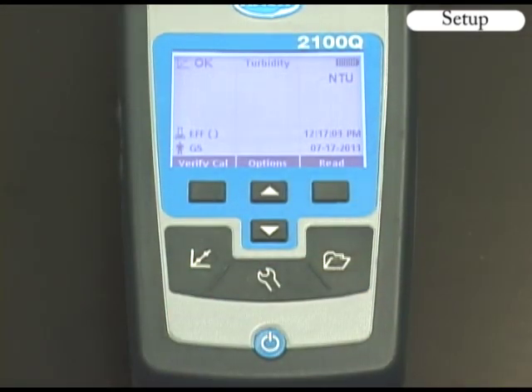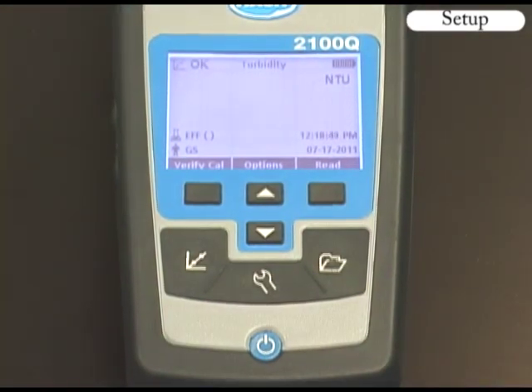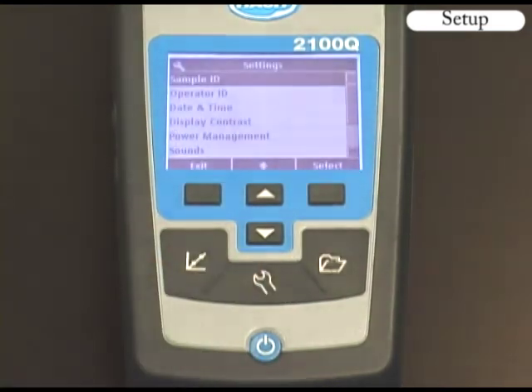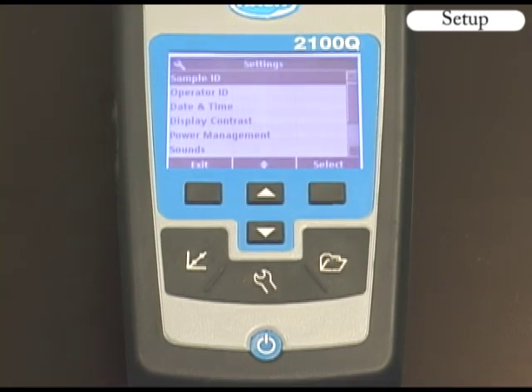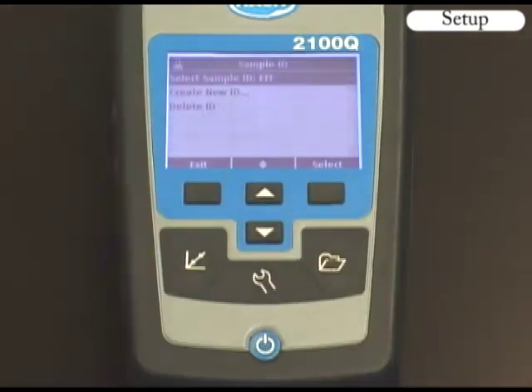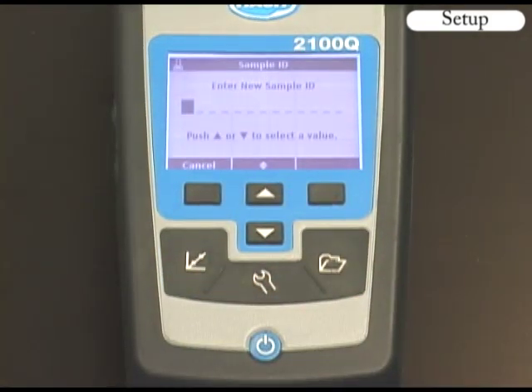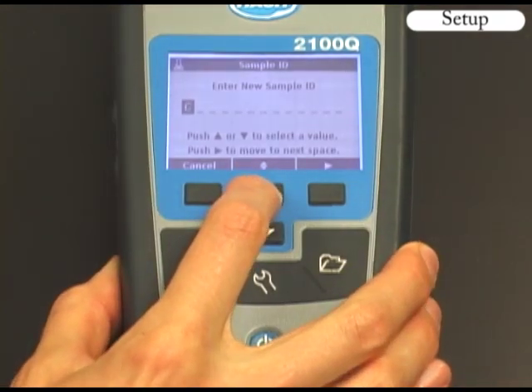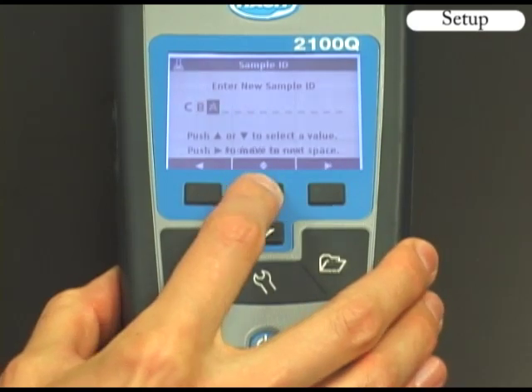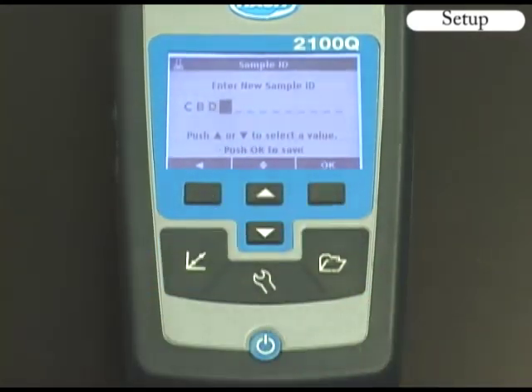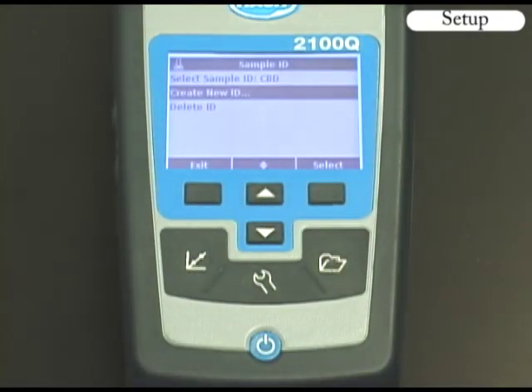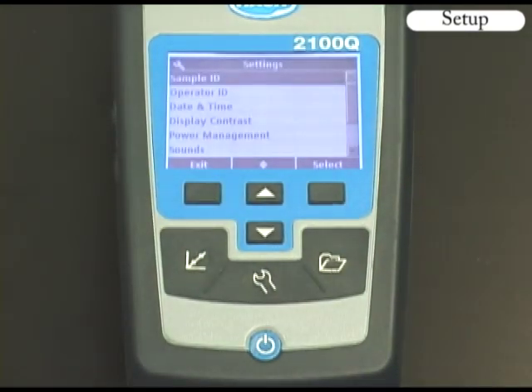When the date and time are formatted, push the right OK key to save the information. Press the settings key for meter setup. The 2100Q gives you the option of assigning a sample ID and operator ID to associate readings with a particular sample location or individual operator. Scroll to highlight sample ID and push the right key. Select create new ID and enter the new sample ID using the up, down, and right arrows. Press the left or exit key to return to the settings menu.